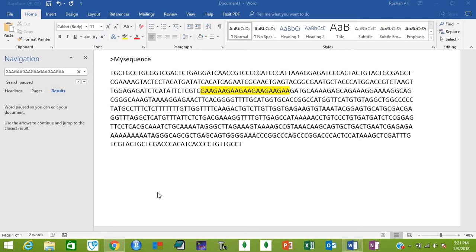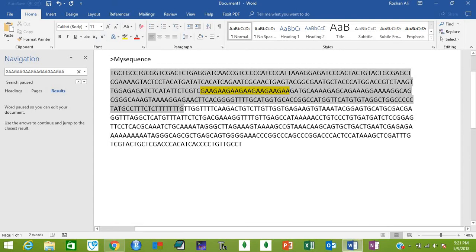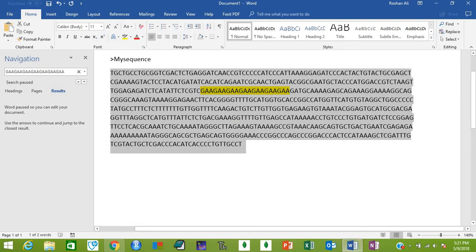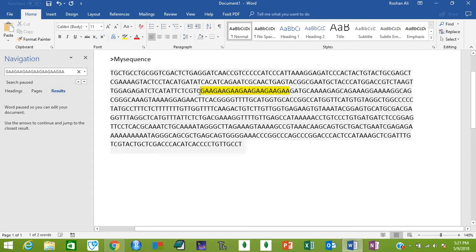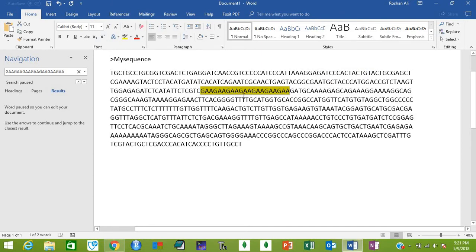For example, you have a nucleotide sequence like this and you've given it the name 'my sequence.' This is your SSR in this sequence - GAA GAA GAA - it's a simple sequence repeat, that's why it's an SSR. I want to design primers that flank this SSR.